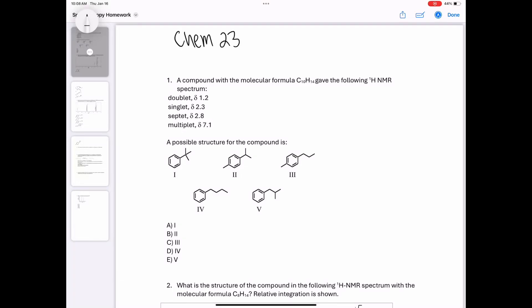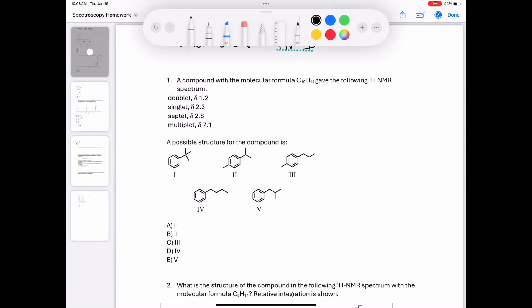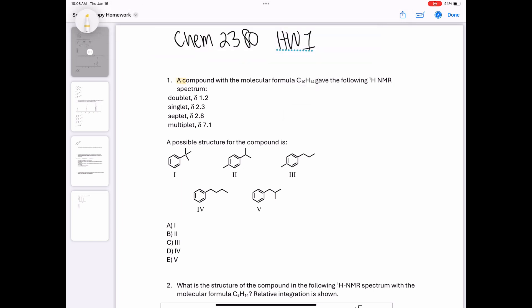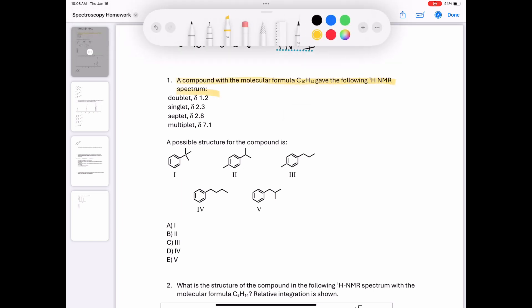In this video, I'm going to be going over the first homework for Dr. Kalini's Chem2380 class. Question 1 says: a compound with a molecular formula C10H14 gave the following proton NMR spectrum.